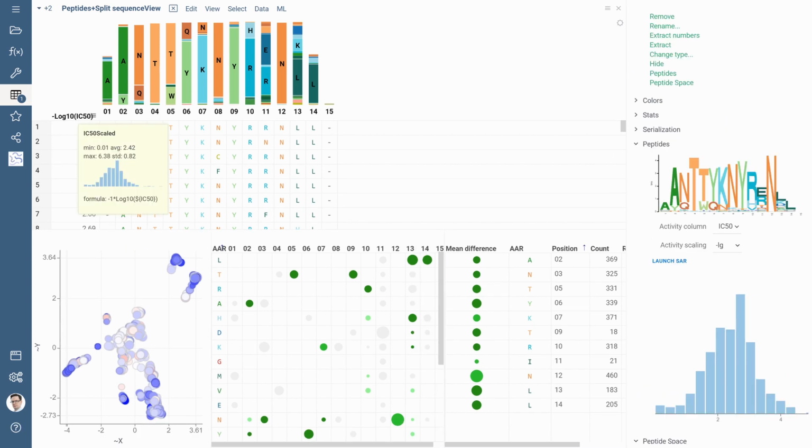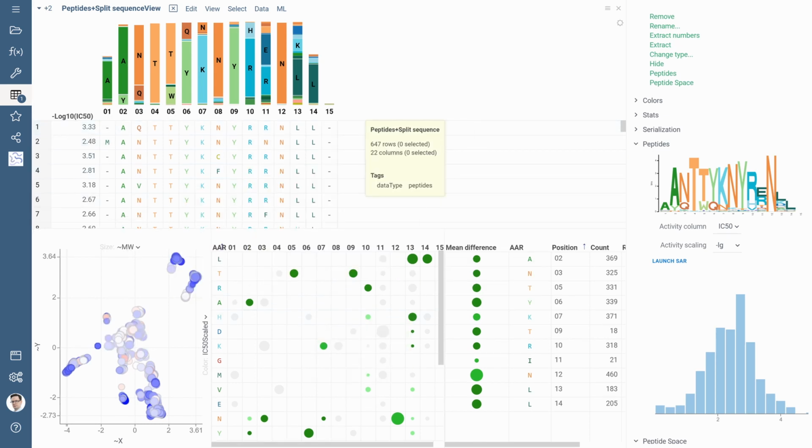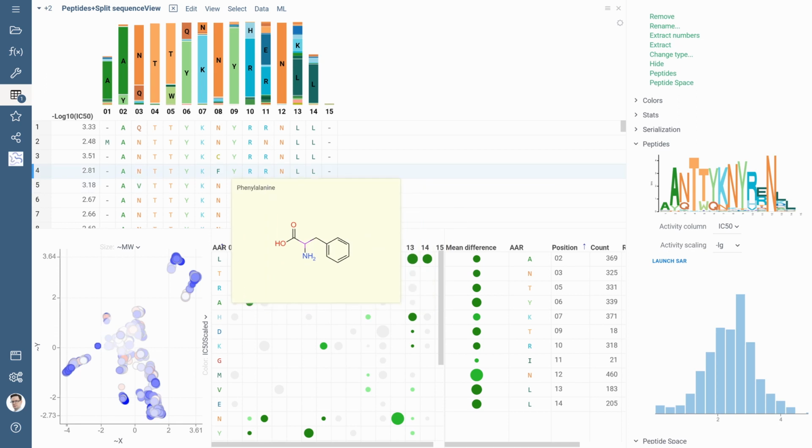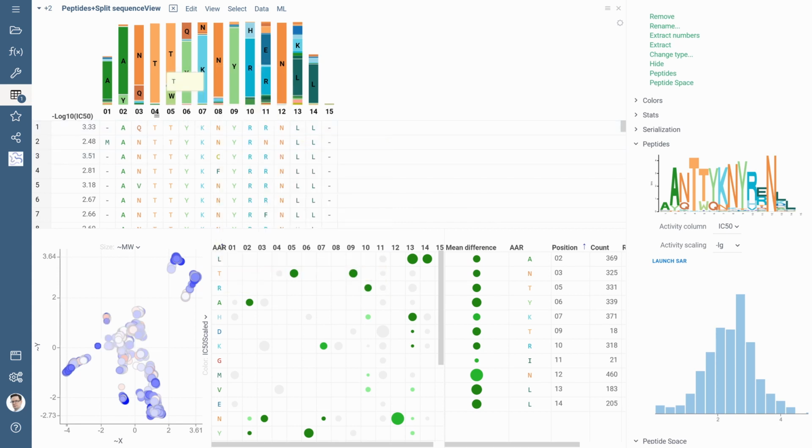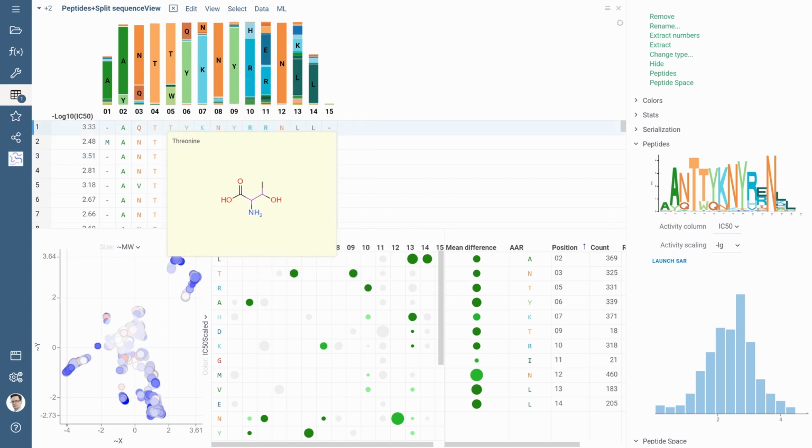When the analysis is launched, we can check the transformation for analyzed values, and now they seem to be distributed normally. The analysis itself provides a bunch of tables for the sequences. To facilitate the interpretation of analysis results, the sequences are now replaced by alignment table, where the split sequences could be found and where we can inspect each residual in each position and compare it to composition analysis plot at the top of this table.